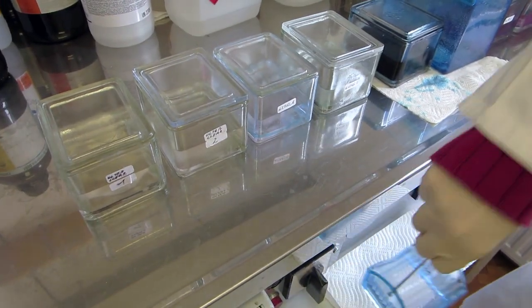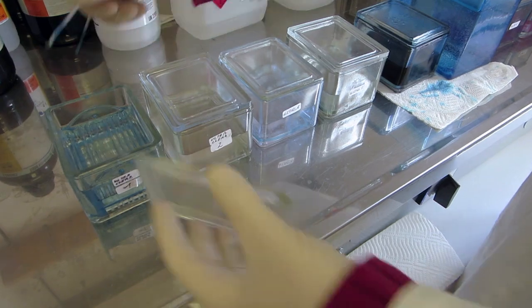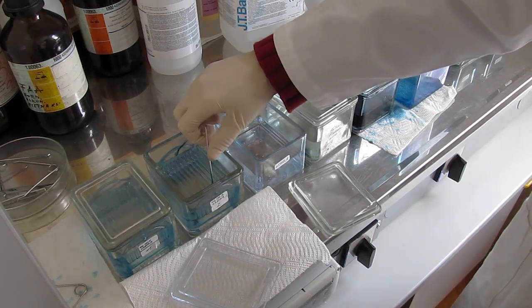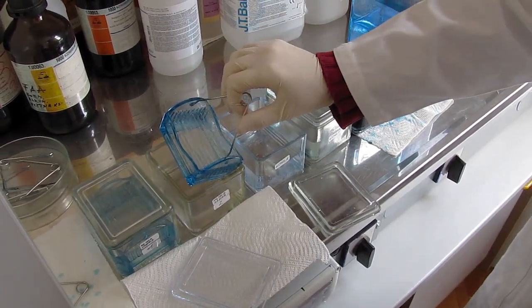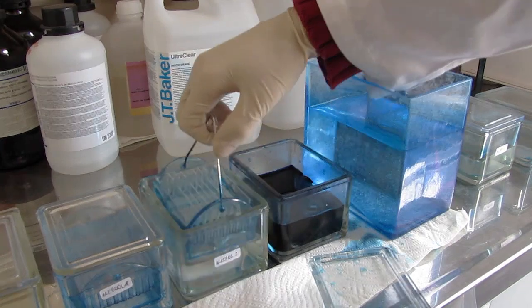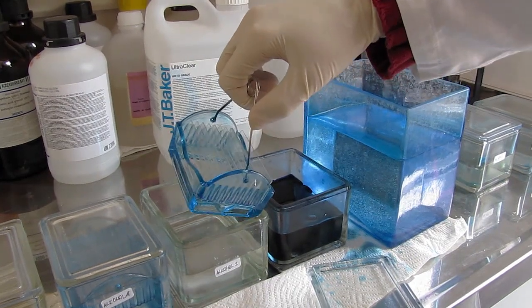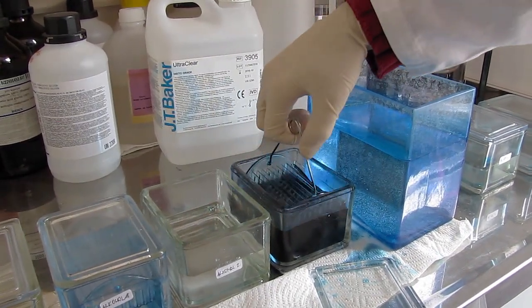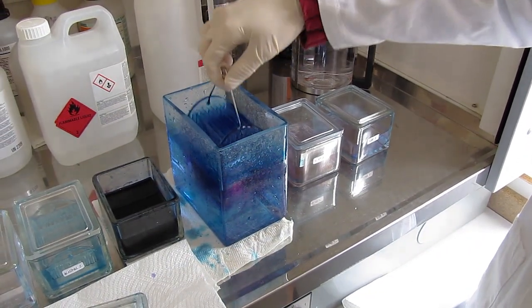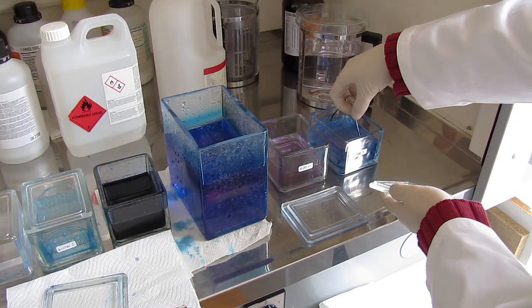Before staining the sections, the paraffin should be removed from the slices. Therefore, the samples are placed into two baskets with clearing solvent — for example, D-Limonene or Ultra Clear — for 15 minutes in each basket, and after that into two baskets filled with 100% ethanol, also for 15 minutes in each. Then the sections can be coloured in a water solution of Safranin and Astra Blue, again for at least 15 minutes. After that, the sections are washed clean, first with distilled water and followed by 70% and 100% ethanol for a few seconds.